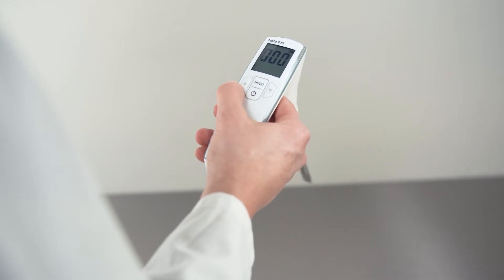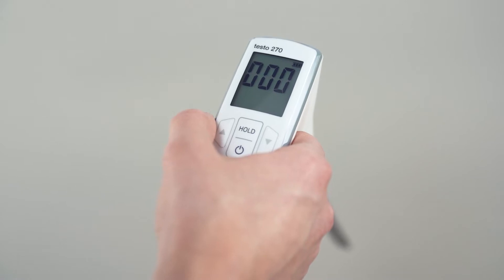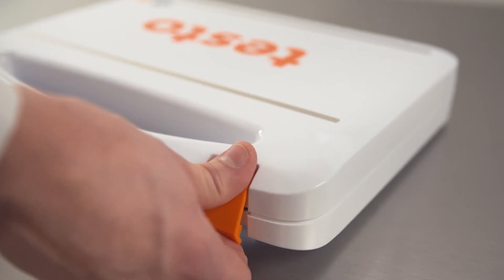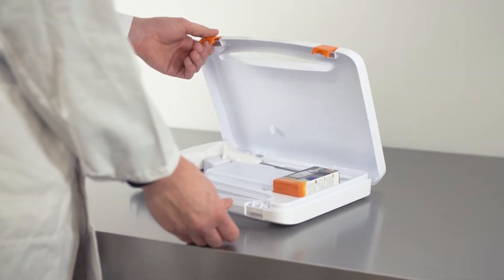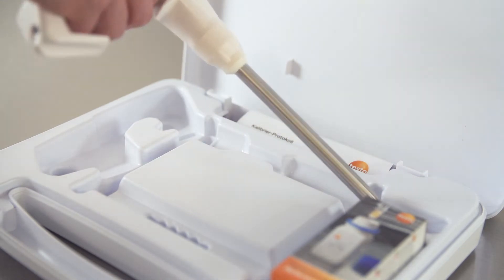With the handy testo 270, you can determine the quality of frying oil quickly and reliably directly on site and without any consumable materials. Your testo 270 is delivered already pre-configured and can start measuring immediately.